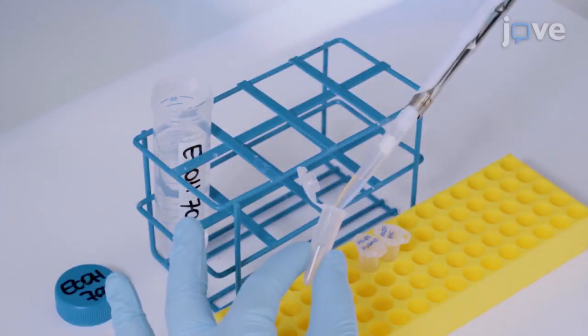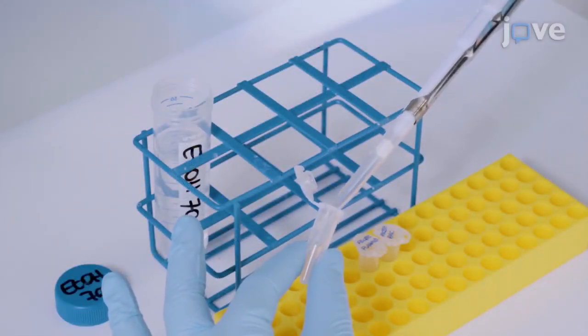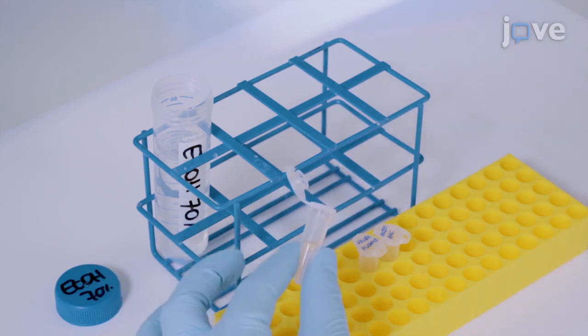After discarding the supernatant, wash the pellet two times with 500 microliters of 70% ethanol.